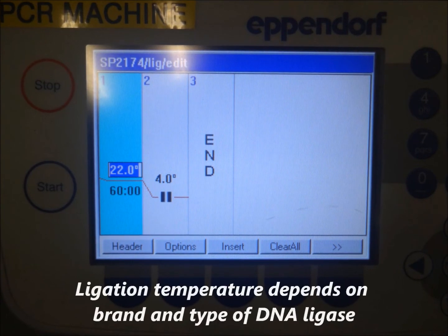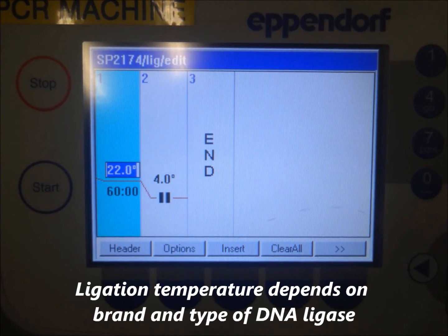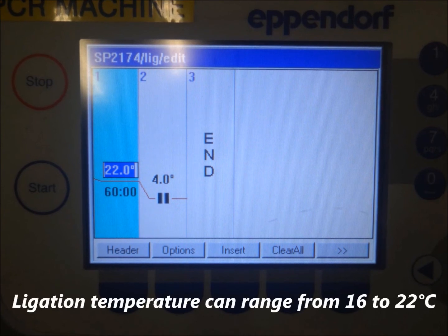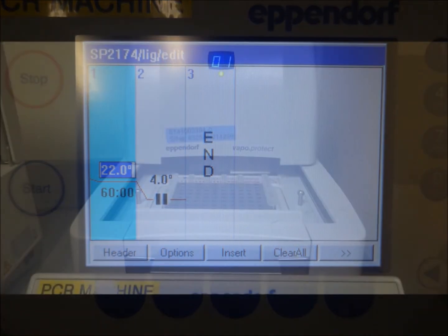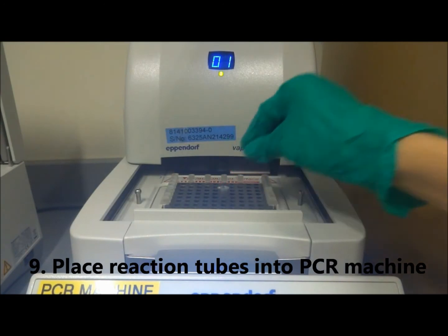However, the ligation temperature depends on the brand and type of DNA ligase used for your experiment. The ligation temperature can range from 16 to 22 degrees Celsius. Place the reaction tubes into the PCR machine and start running the reaction.